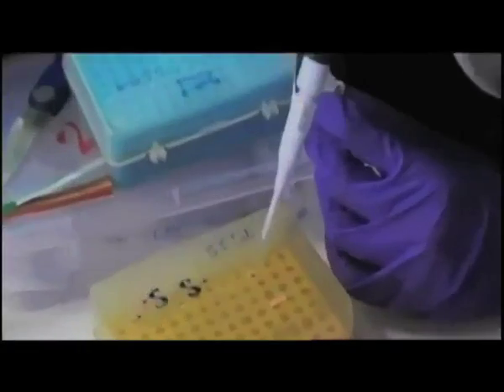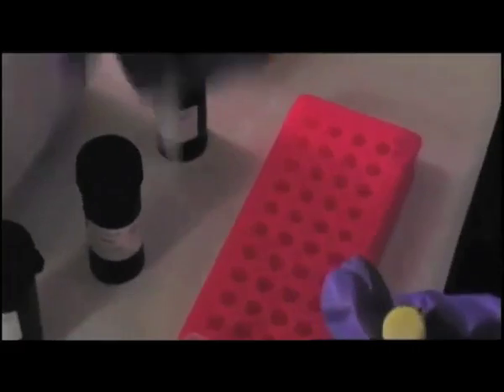The pH of the sample will be adjusted to 8.5 using 100 millimolar NaOH. Take out the Cy dye tubes which are stored in a dark container.